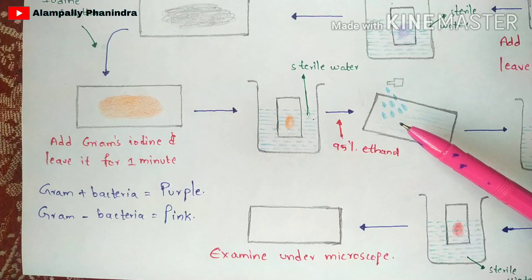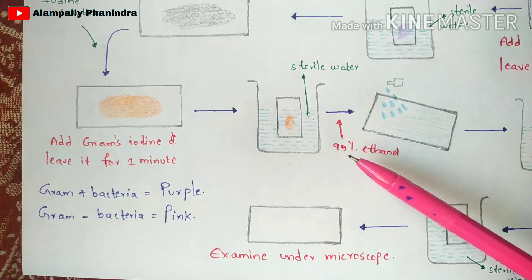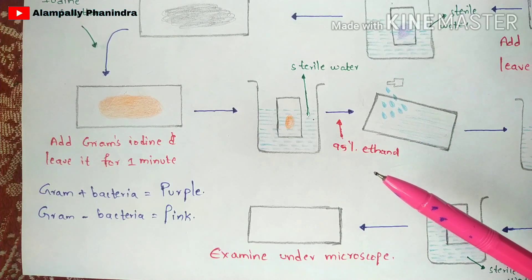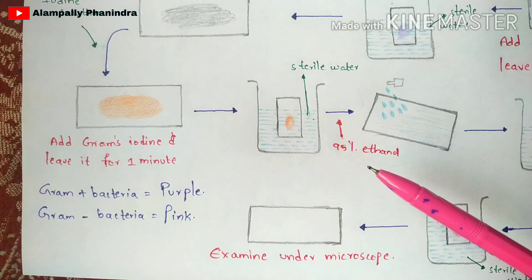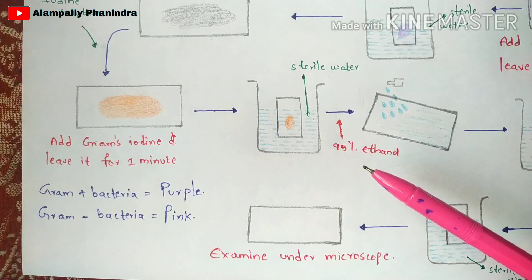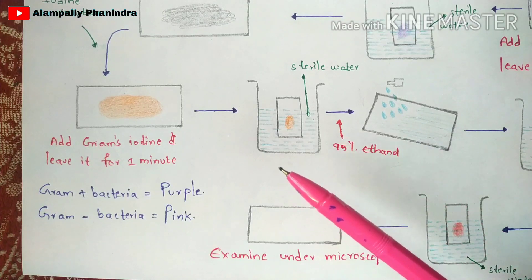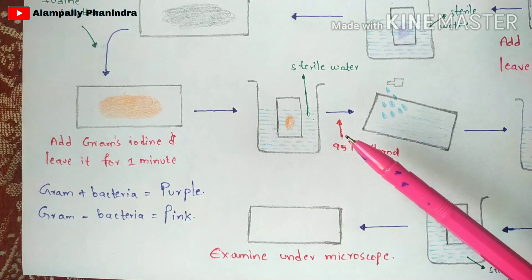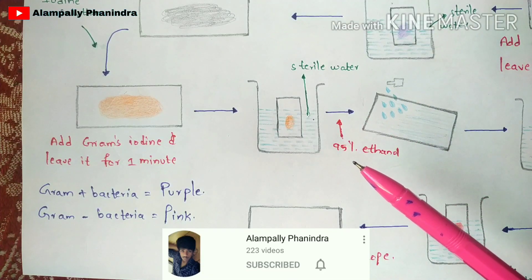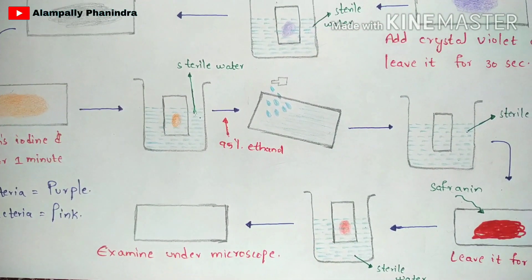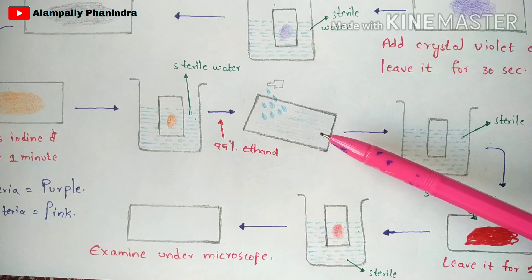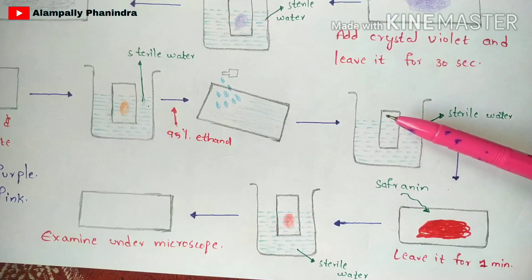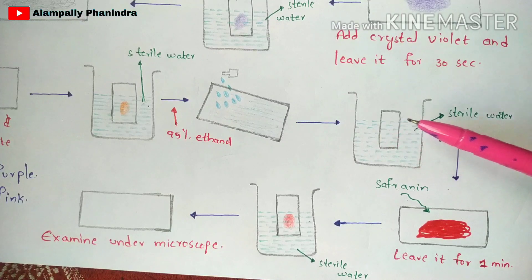After removing the slide, place it at 25 degrees and add 95% ethanol, which is the decolorizing agent. Decolorizers help remove any remaining color from the slide. We have added crystal violet and gram's iodine, so any residual color will be removed by the 95% ethanol. You can also use alcohol as a decolorizer. After adding the decolorizer, take a water bath with sterile water again and wash the slide, then remove it.